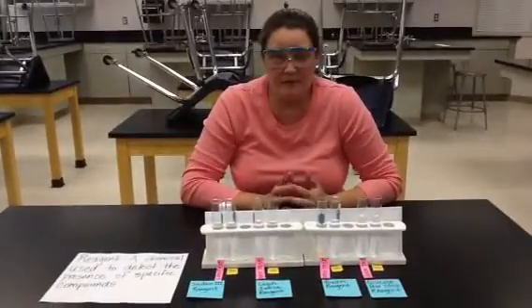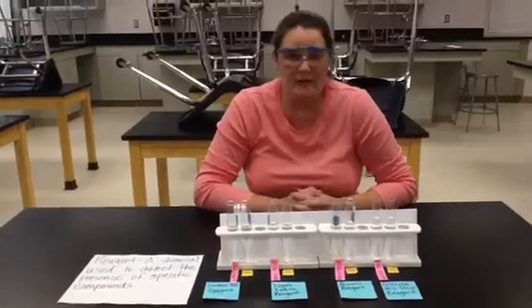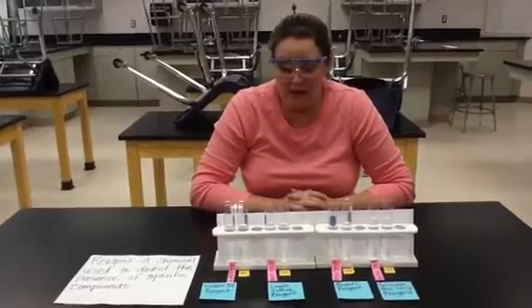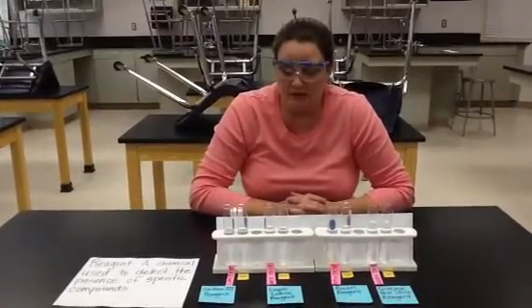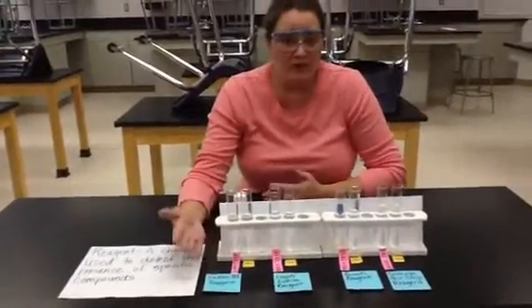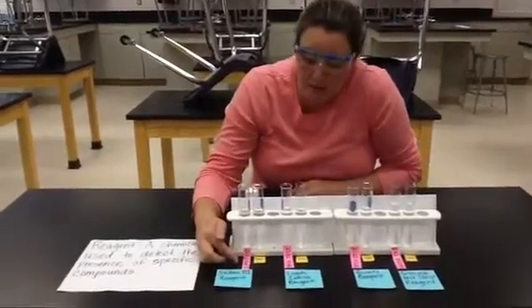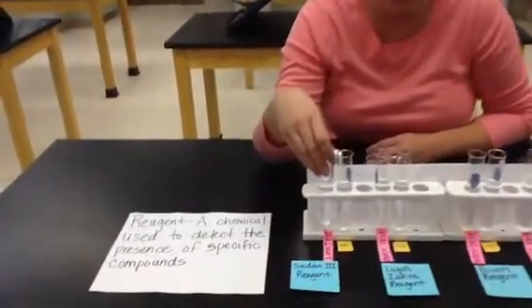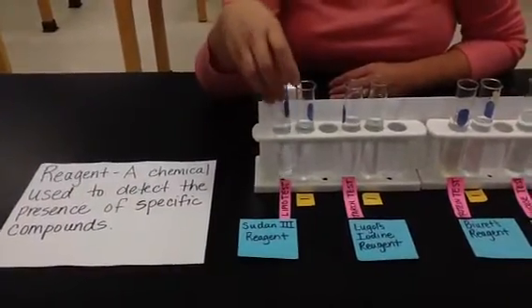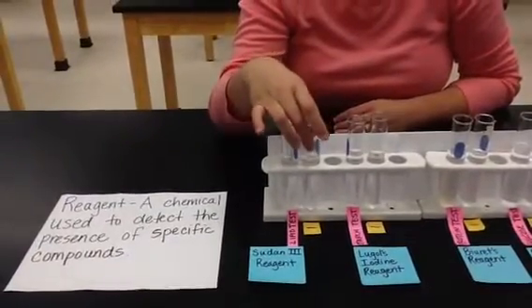So I'm going to run through the demonstration with you, and this is exactly what you hope to see if there is a reaction within a solution, if it has that particular compound. We're going to start with our lipid test, and on Monday you are going to watch this again with me live, but I want you to start looking at it now. In this lipid test we have one that's got a lipid solution, so it's got some kind of fat or oil in here. I'll just tell you it's in there. This is going to be our negative test. This does not have lipid in it.